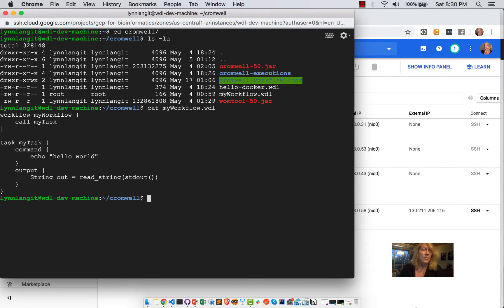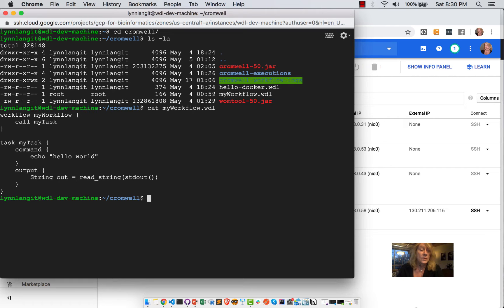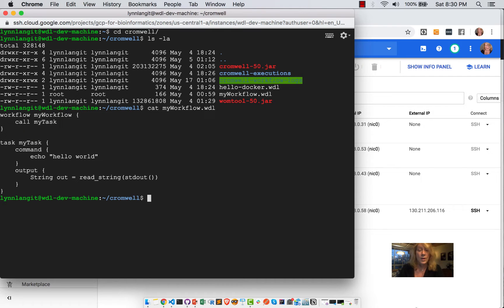Now I have two WDL files. And the first one is my workflow, which is the same one as we saw in the example repository. So the question is, how then do we run this WDL script using Cromwell?